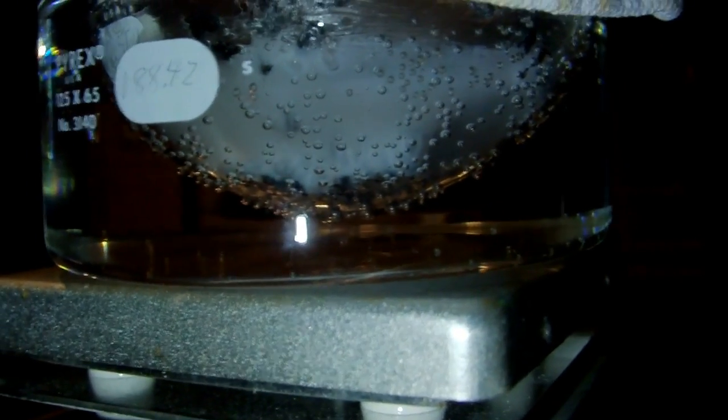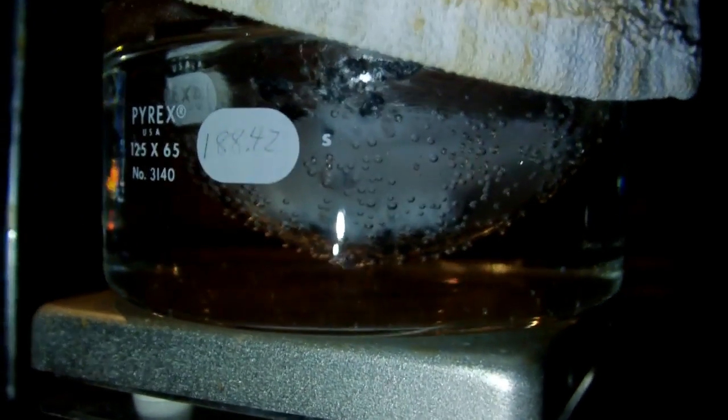So the temperature in the still head has risen to about 45 degrees and the boiling has slowed significantly. You can see down here that it's barely doing anything. So I think now's a good time to stop the distillation. So I'm just going to turn the heat off and unwrap everything and let it cool down.